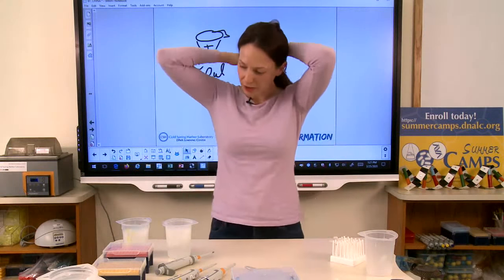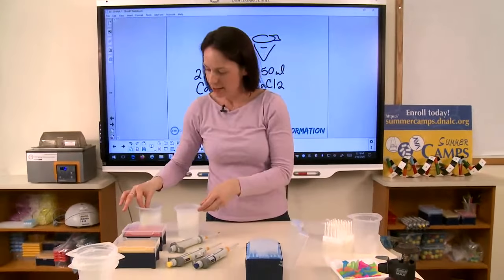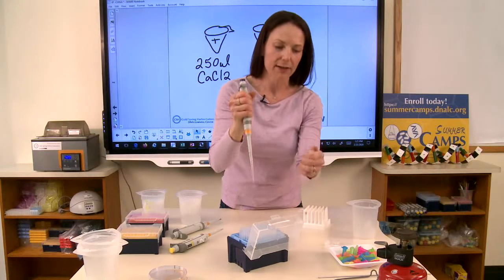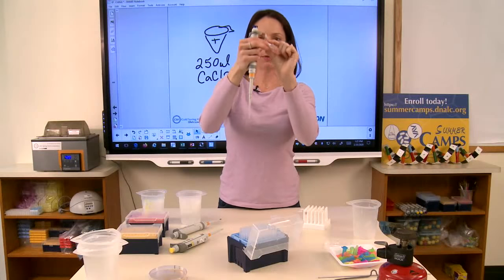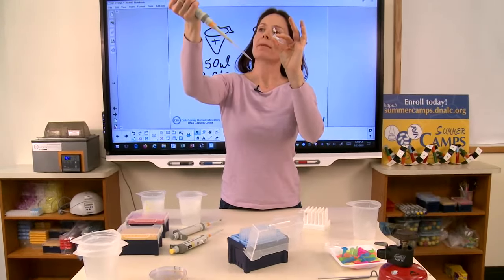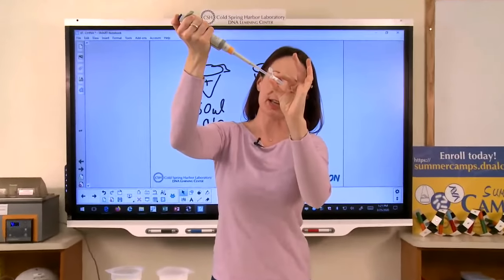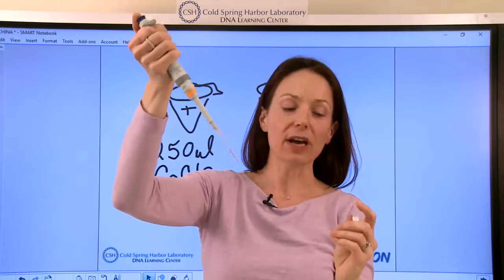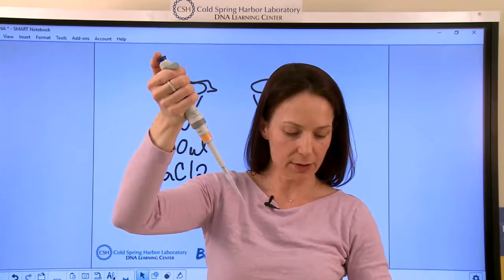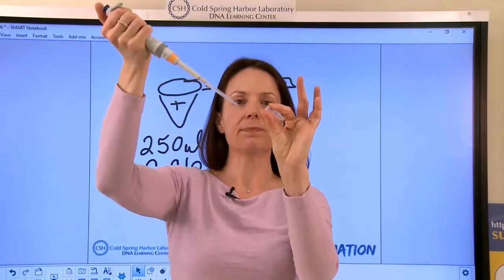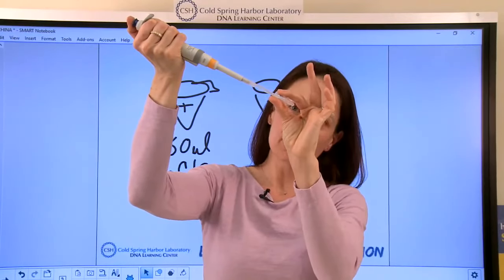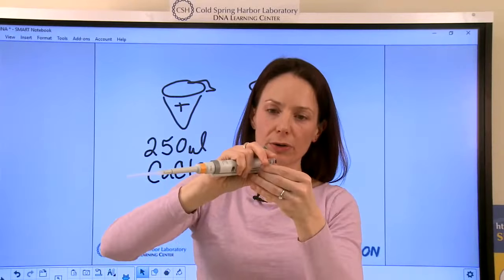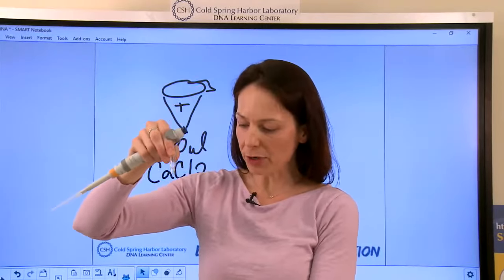Let me show you how I do this with the pipette. I'm going to open the tip box and I have my calcium chloride. Just double checking that my pipette is correctly set. Going to go to the first stop on this pipette. Gently place the tip of the pipette into the liquid, and I'm slowly going to draw up. I'm keeping everything at eye level so that I can see exactly what's happening. I'm going to pick up one of my tubes, place the tip toward the center, and just gently release all that liquid. When I've added the calcium chloride, I'm going to place that on ice.